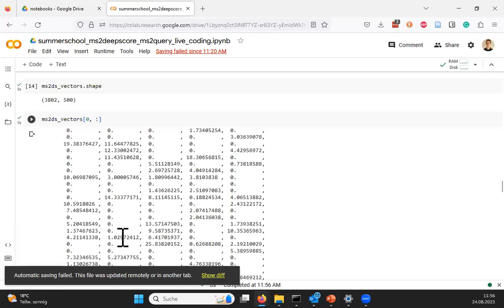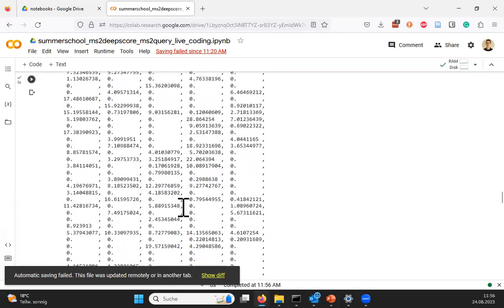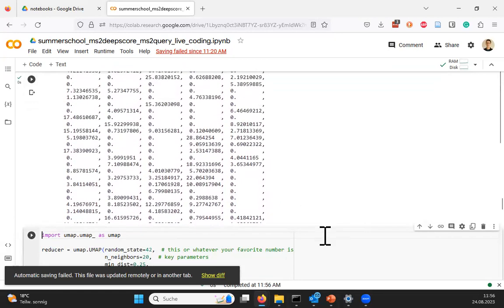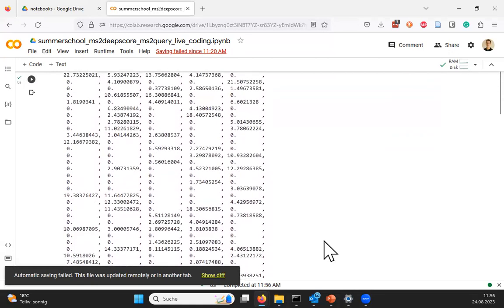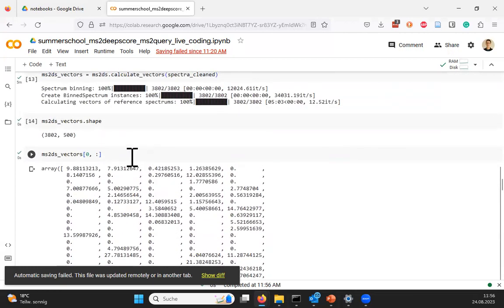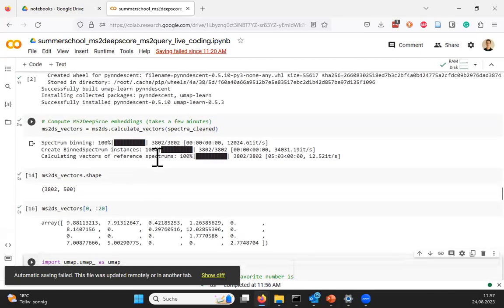But some are surprisingly high here, for example, but this is a vector, so it has a lot of zeros in this case. But I cannot influence this so much, because this is what the network learned to compress a spectrum. And you can immediately see that this is nothing that helps you any further. So let's only count the first 20. These numbers are totally weird for you. So this is to say that with this vector alone, you cannot do much.